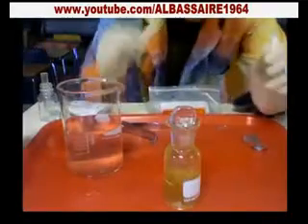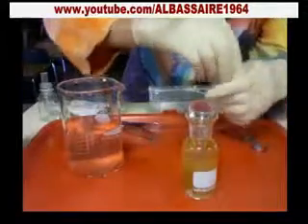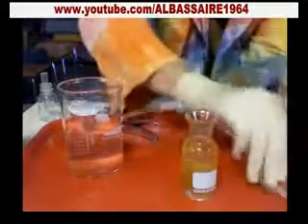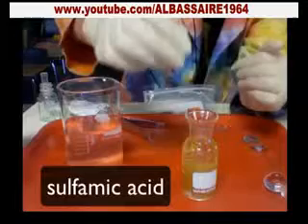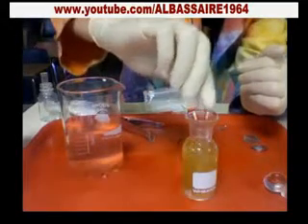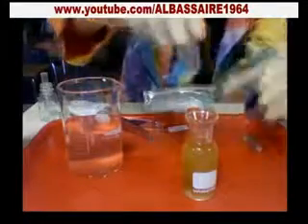Okay, the flock is settled out again, and you can see that it looks like we have some oxygen in here. The next thing I'm going to do is take the top off and add the third chemical. This is called sulfamic acid, and when it mixes with that, it should get rid of that precipitate and turn it to a yellow color. So I'm going to shake it again, and we should be able to get rid of that flocculant.